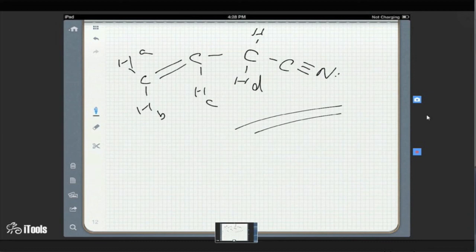No, because an imine is not an alkene. I'm just mentioning that because at one moment it sounded like you guys thought it could be either an imine or an alkene. But 4.5 to 6 is only an alkene. It's not any old double bond. It has to be an alkene double bond. There were other reasons you were thinking of imines too, but I just wanted to clear that up. 4.5 to 6 is not imines. It's alkenes.